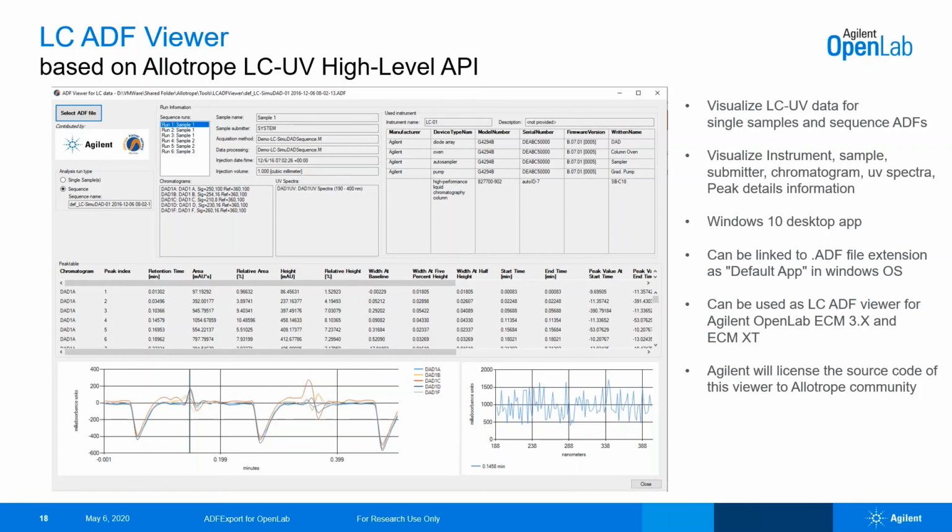I would like to know, in the graphs we see at the bottom of the screen, if we have the possibility to zoom out and zoom in and do some experiments there, because we are also checking from the regulatory point of view. So it would be very useful if we can zoom in to fulfill some regulatory requirements. Thank you.